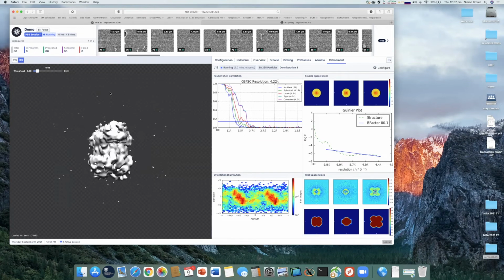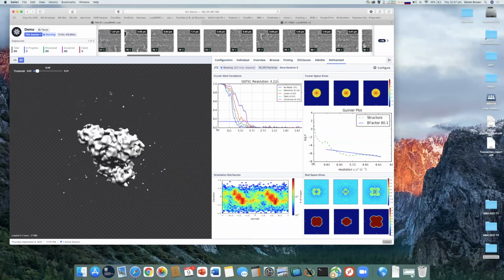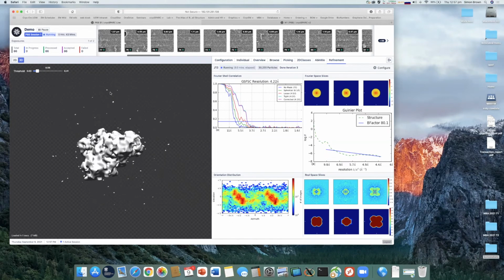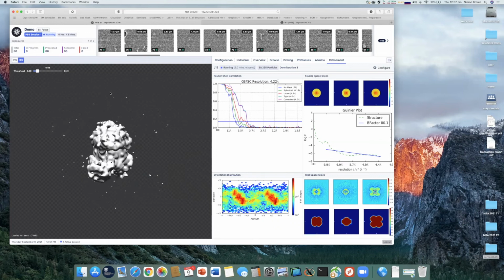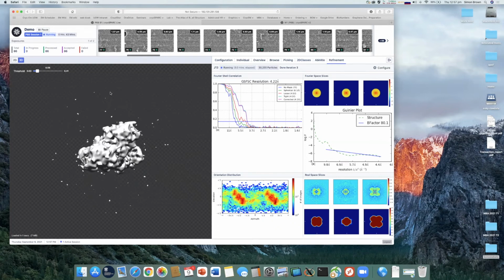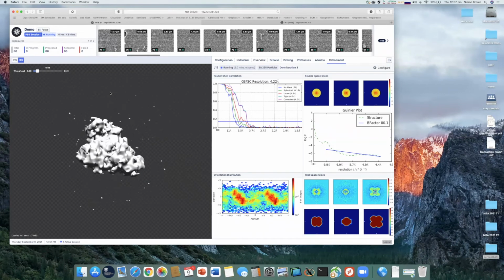Both James and Simon have explained to me that that's a pretty good deal, given they look after the updates. If there's a problem or it needs reinstallation, there's someone they can pick up the phone to. So if you do use cryoSPARC and you don't have the local resource to support the software, you might want to talk to Single Particle.